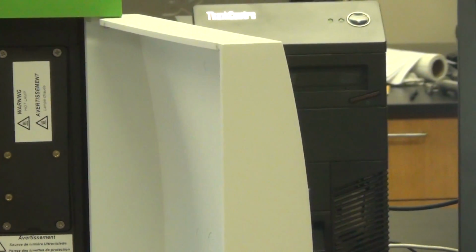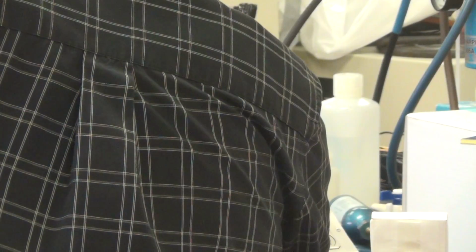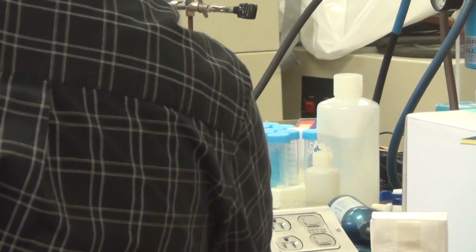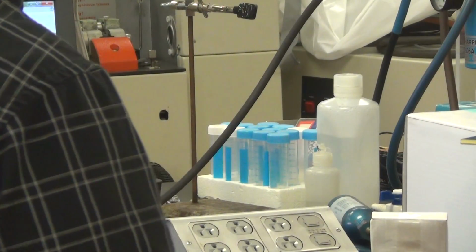Okay, now let me show you what you can do to make it talk to it again. I double clicked on here, brought up flame. I say reconnect. It says establish connection to it. It says it's not connected. It's not far enough into its power up. But click on that, it brings up the spectrometer and the flame. Oh, and also spectrometer over here. You click on this, and it tells you if you have problems, red X or something, if the slit, prism, or the grating, or the gas control was the issue.